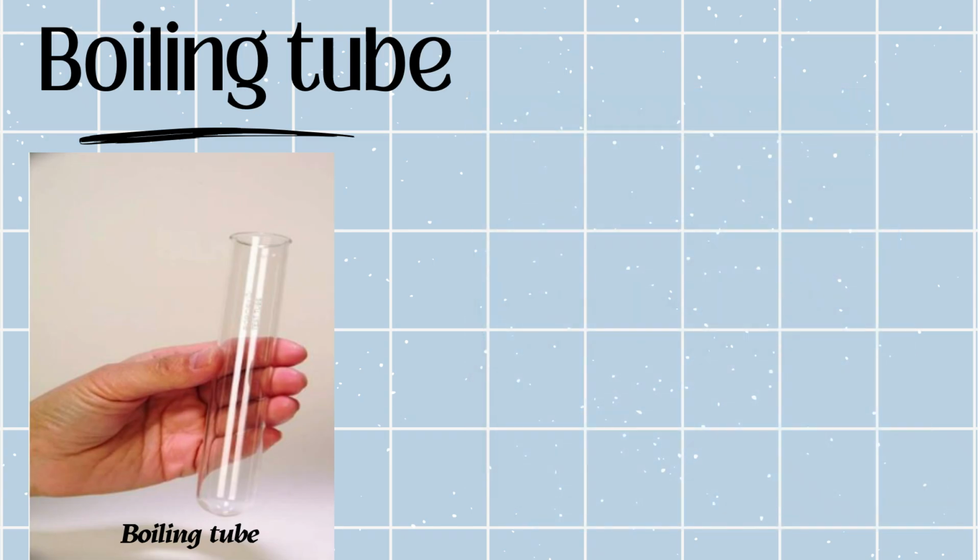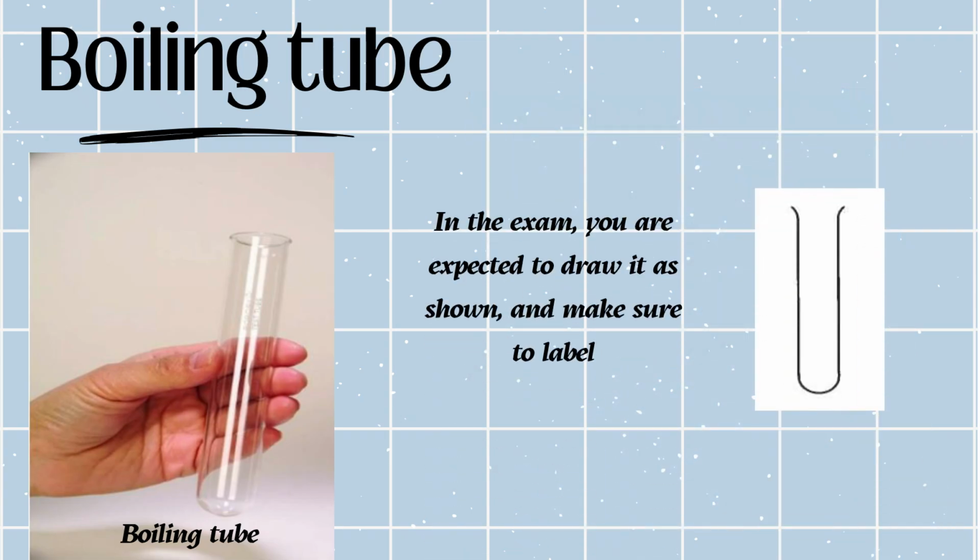It will withstand. Now let's see how you're supposed to draw it in the exam. As you can see in this diagram, it is much thicker or wider than that of the test tube.